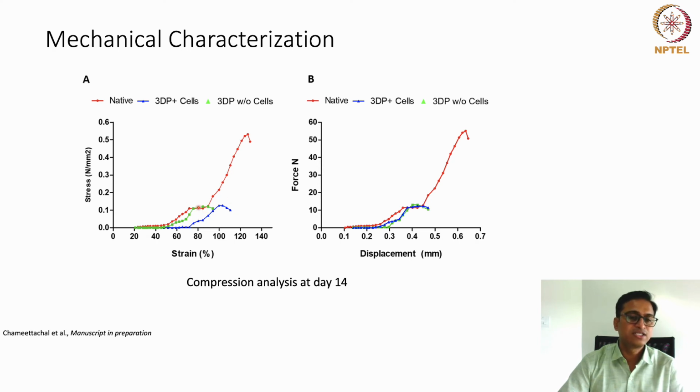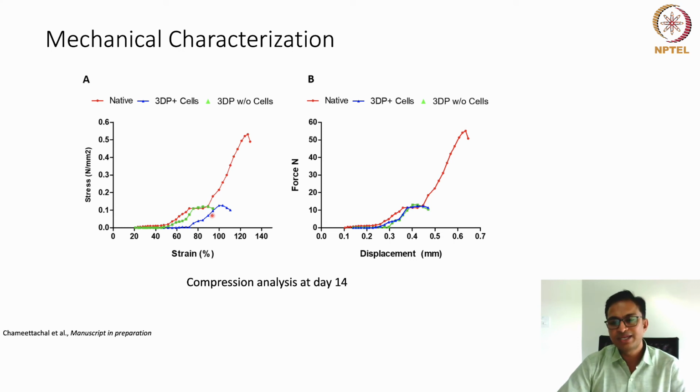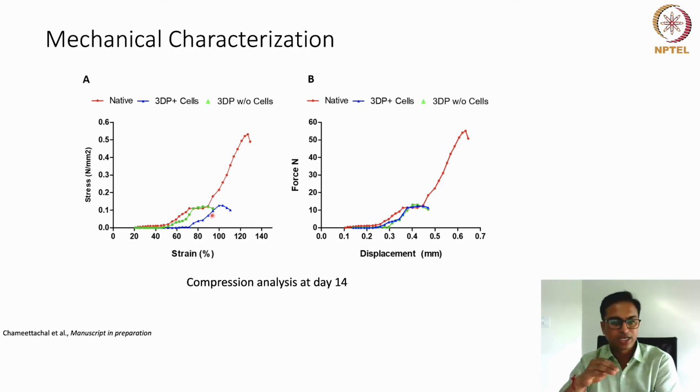But please understand, this is just the cell-laden hydrogel. In this case, the cells have not matured, and there is also some cross-linking and other things that are not yet fully regained. So that's why this tissue is mechanically not comparable to the native cornea. But the important thing is, if the tissue can be handled well, and if it can be put onto the surgically depleted site and transplanted, and then at the initial stage, if we can control the attachment of this bioprinted cornea with the native tissue, and it can be successfully integrated, that's a very good thing.